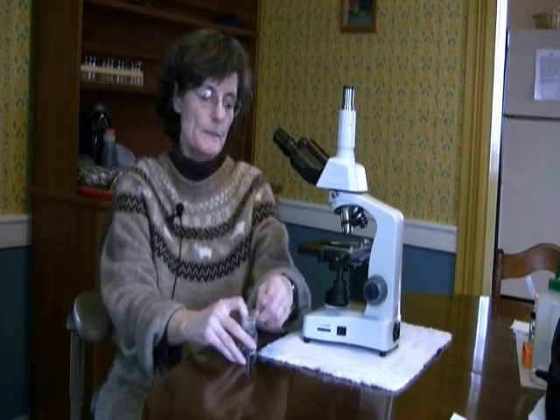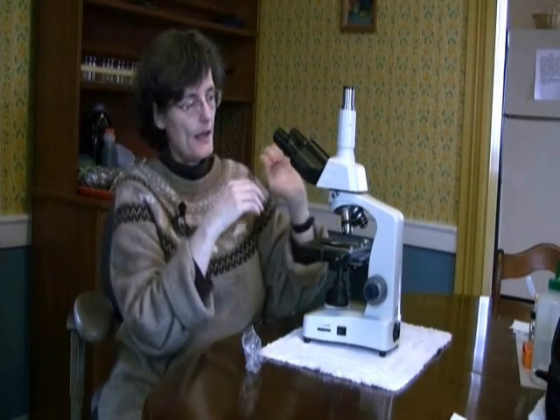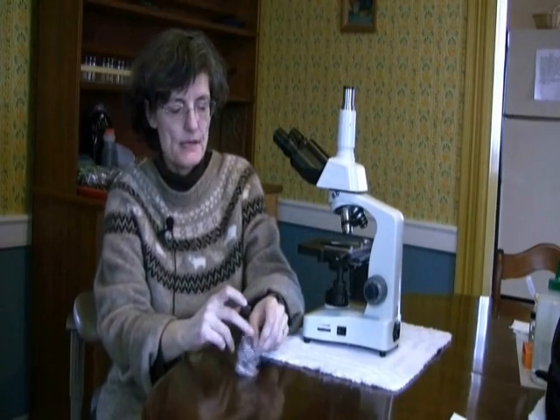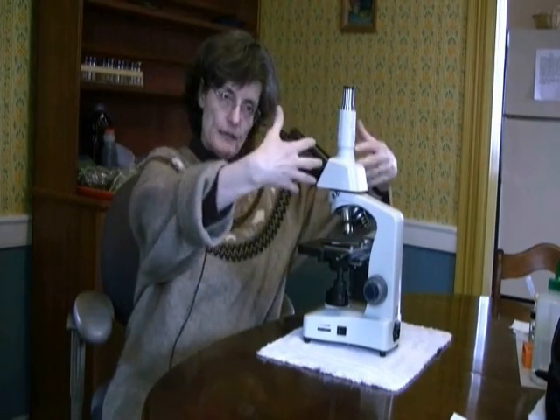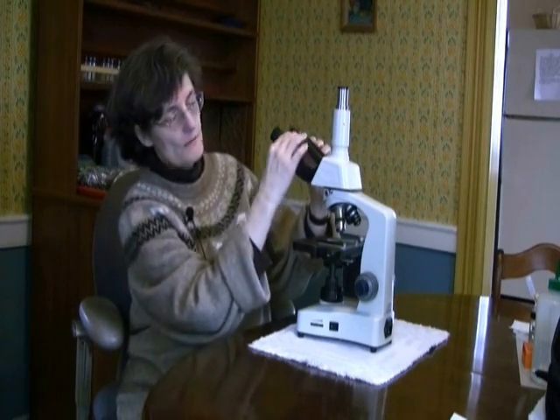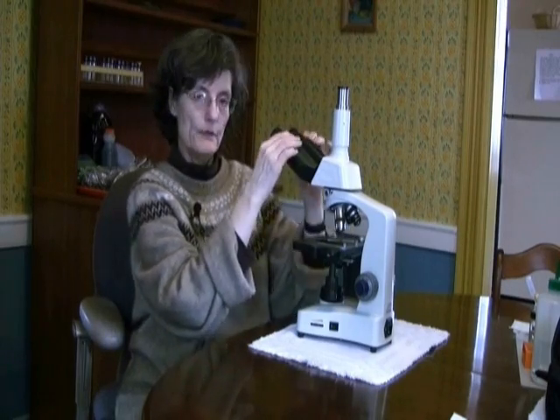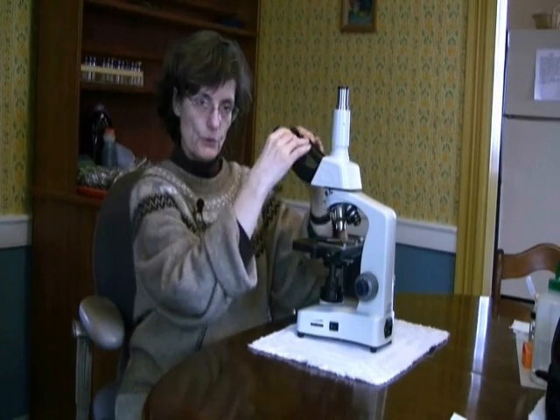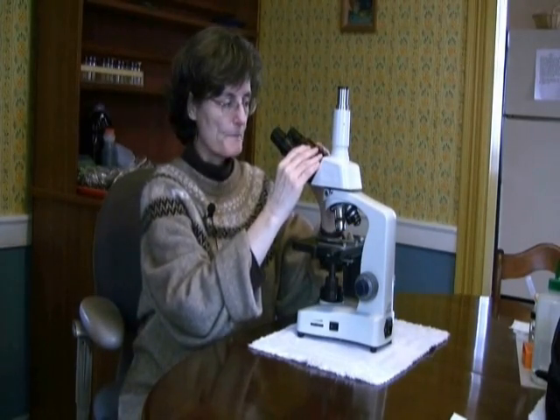So here's my next 10x eyepiece. Pull the cover off, slip the eyepiece right on in. And again, save the parts. You don't want to have the eyepieces off your microscope for very long at all because dust and dirt getting into the internal parts will reduce your resolution if you get stuff inside there. You notice that one of these eyepieces is not focusable and the other is. So when we get a little further along here, I'll be showing you what to do with these two, one focusable, one not. What are you supposed to do with those?